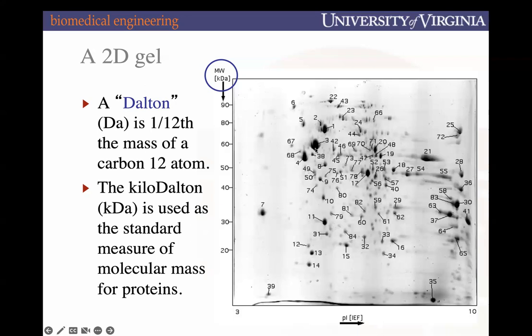You might have bands like band 3 or band 4 that have a vertical tail on that protein, and that might indicate heavy glycosylation, or varying degrees of glycosylation on that protein. There are also horizontal smears on some of these proteins, which might indicate phosphorylation events or other modifications that carry a charge with them. And again, as we described before, the molecular weight for these proteins is typically reported in kilodaltons, and daltons are typically grams per mole.